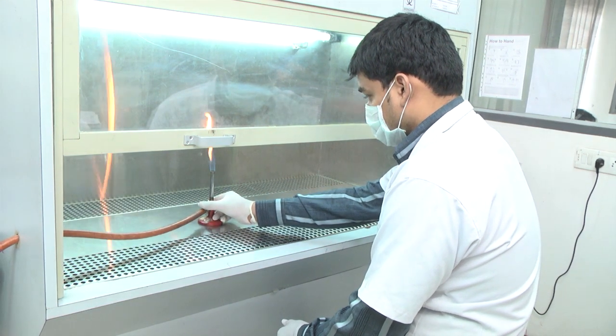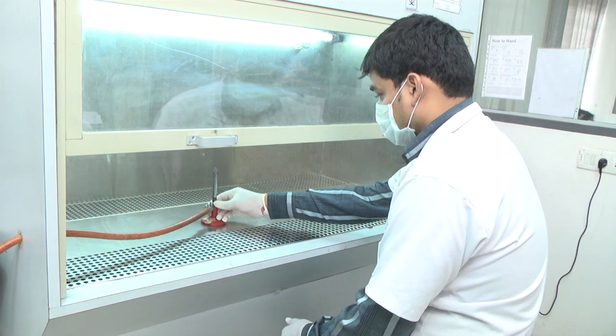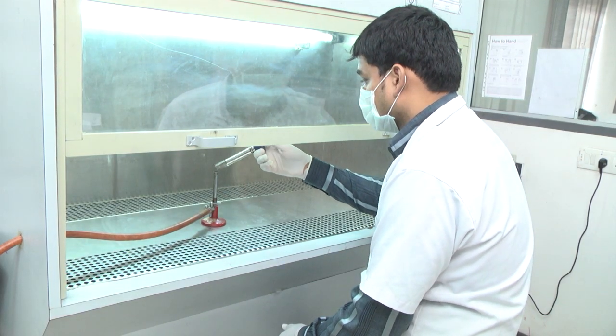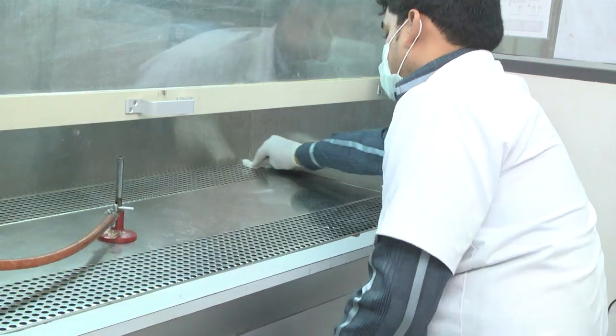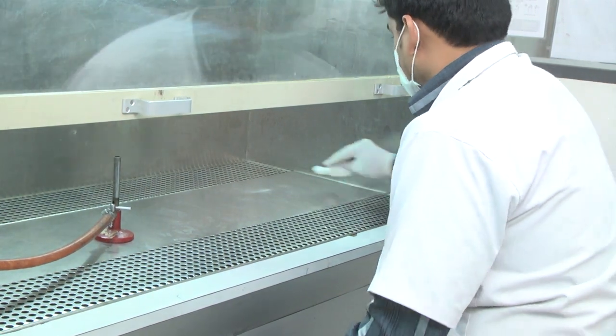Shutdown Procedure: At the end of the day, close the gas burner, allowing all the gas in the burner to be consumed after closing the regulator. Check that no residual gas is left in the rubber tubing. Clean the whole work area with spirit cotton.